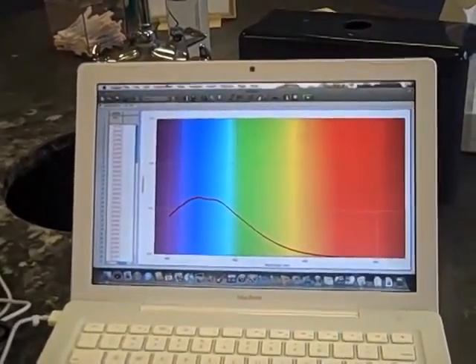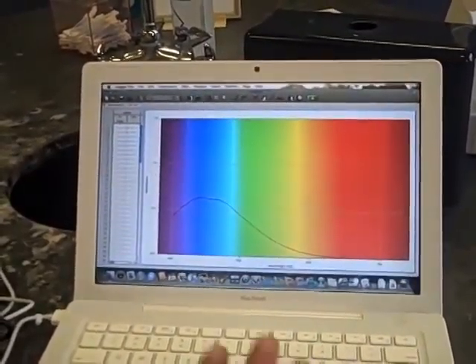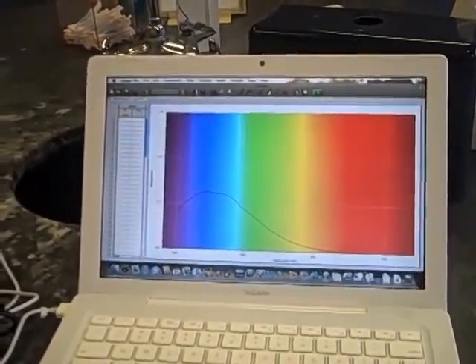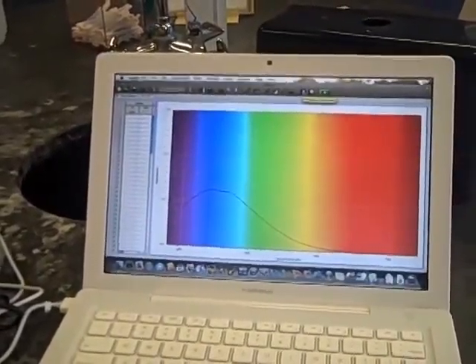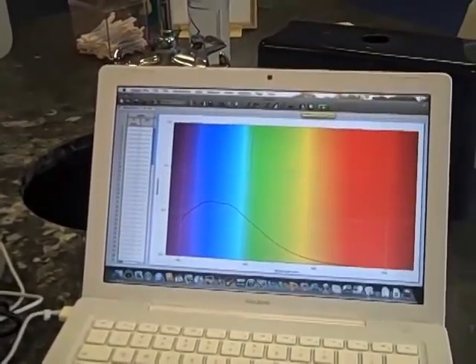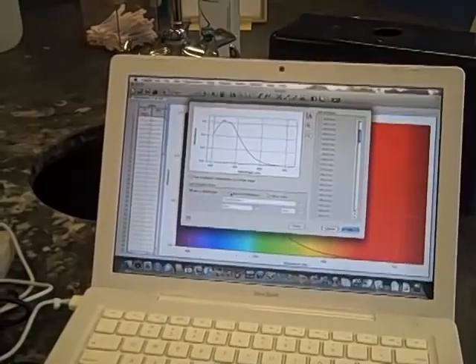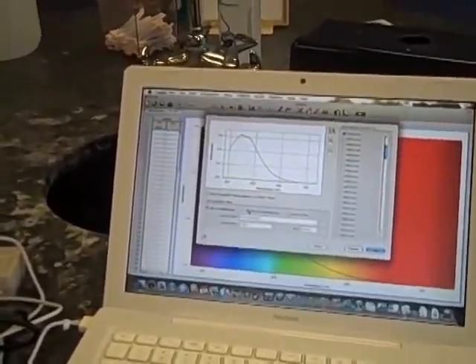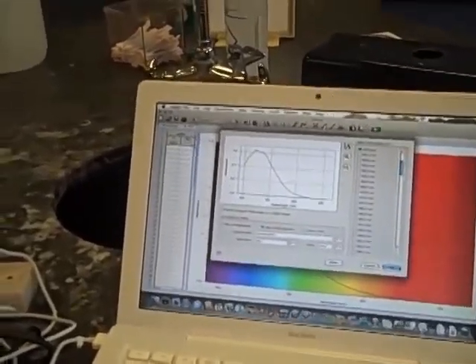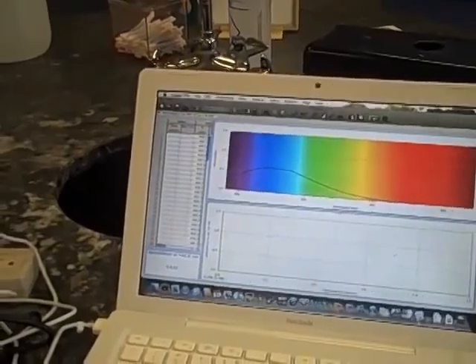So, store latest run, and now it's stored, and then you have to change it to the wavelength? To absorbance versus wavelength. Okay. So you configure the spectrometer, and no, you need to change it from wavelength to absorbance versus concentration. Okay. And it looks like that absorbed at 442, something like that.